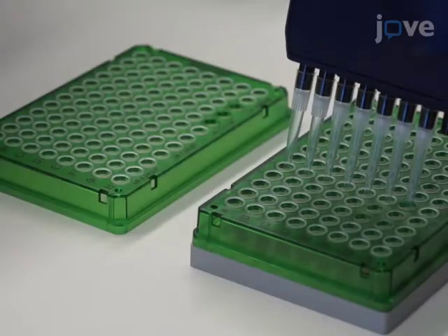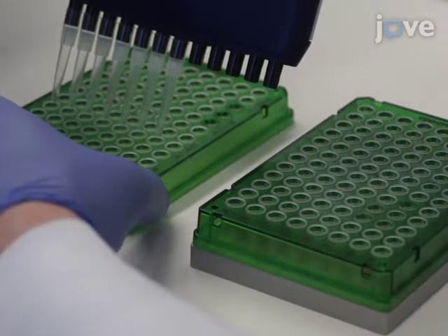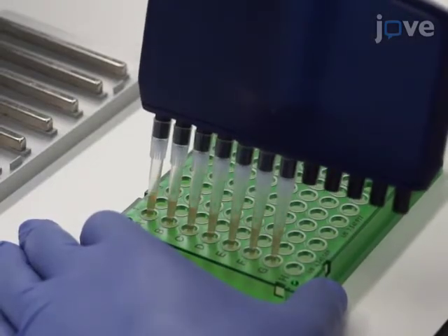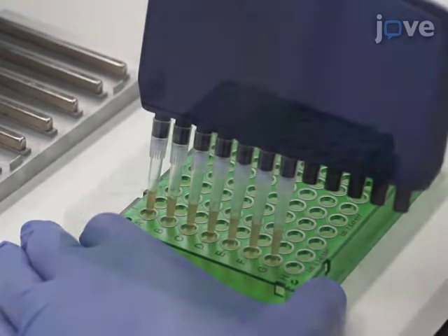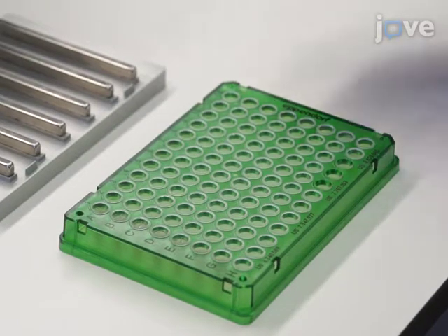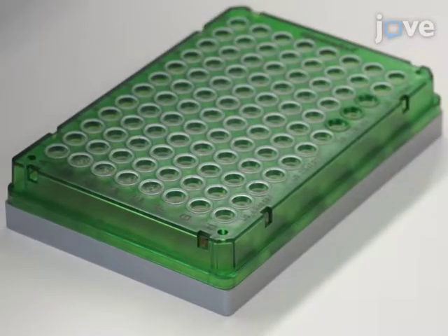On the next morning, place the samples back on the magnet and transfer the supernatant to a new 96-well PCR plate which contains the immunoprecipitated DNA. Add 2.3x paramagnetic beads to the solution and carefully pipette up and down 25 times using a multi-channel pipette. Following this, incubate at room temperature for 4 minutes. Then, place the samples back on the magnet and incubate at room temperature for another 4 minutes.